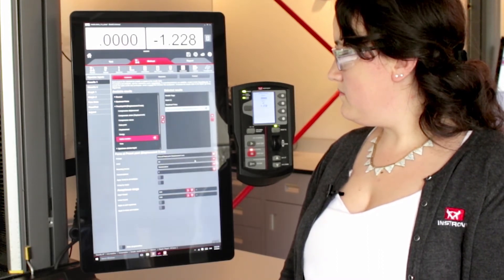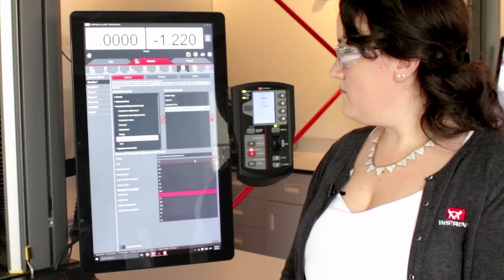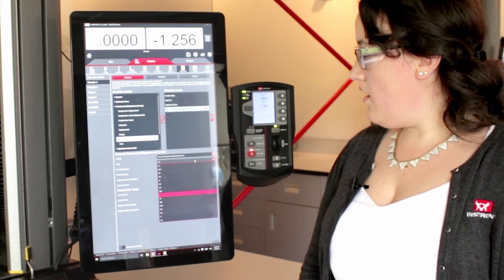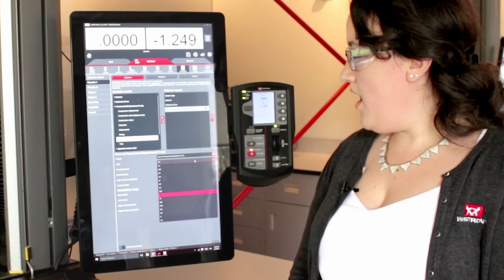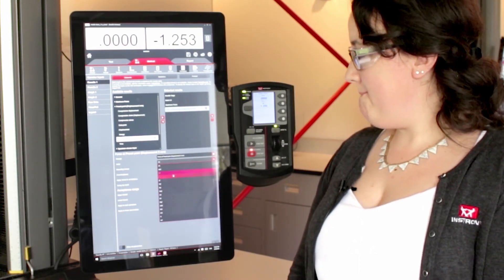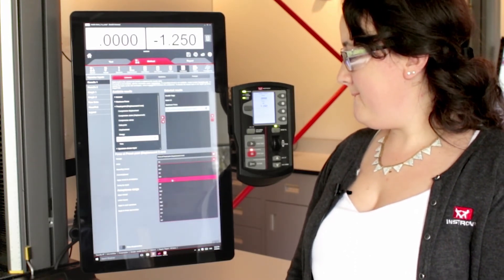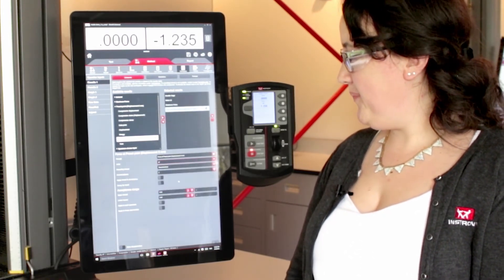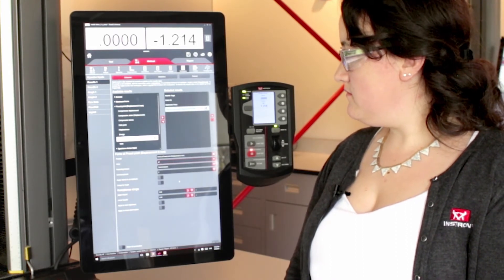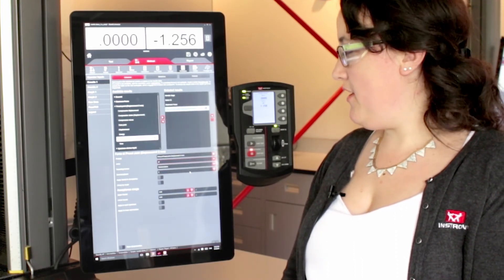Now, for units, what units are you looking to have this measurement, or this result? Grams force would be great. All right, so that's right here. And two decimal places? Perfect.